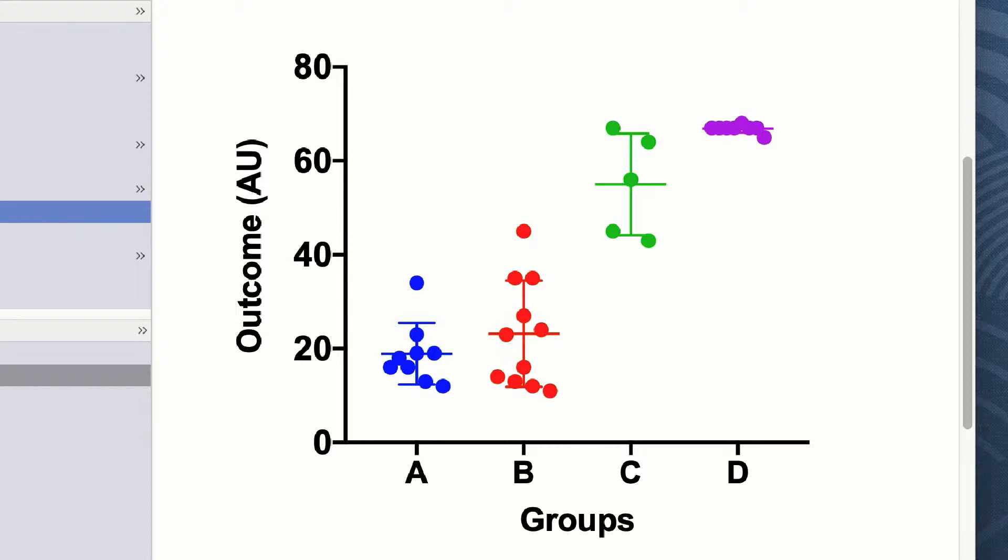Group D, however, has a very narrow distribution of data, very small error bars, and I would be concerned looking at these data whether they might be normally distributed.